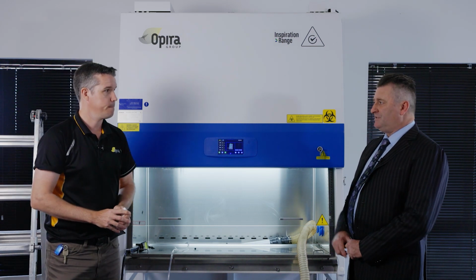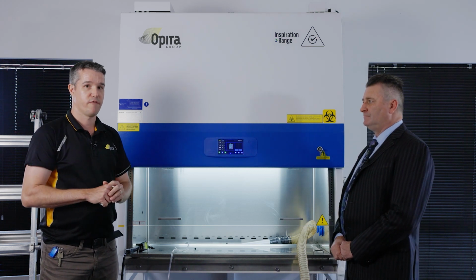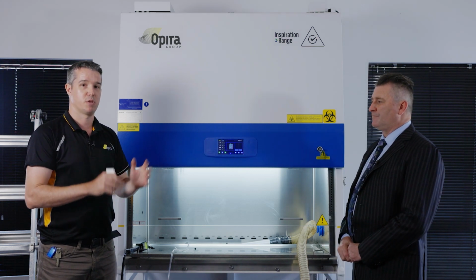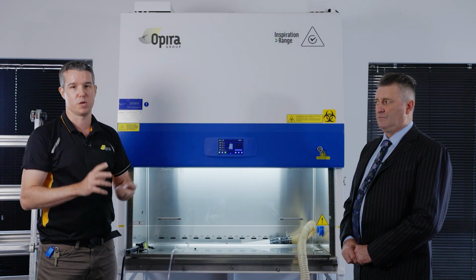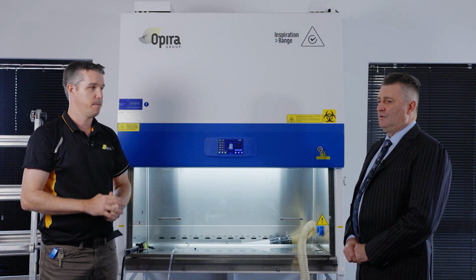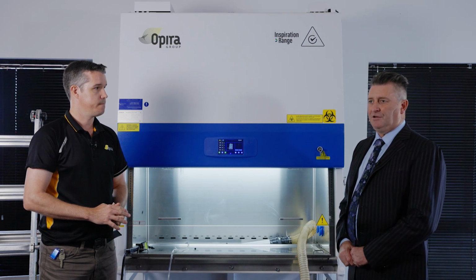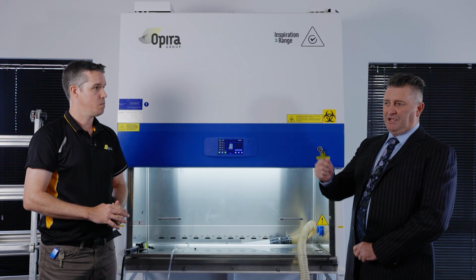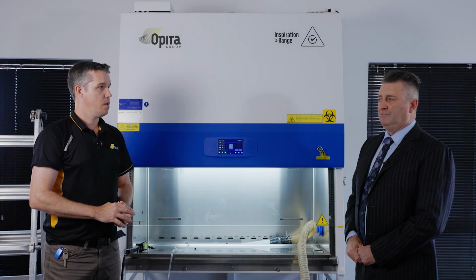And during this test, you've got the screens off both HEPA filters? Yeah, all screens must be removed from the HEPA filter. The test method requires us to measure approximately 25 mil from the filter face, so any screens have to be removed as well. And in the scanning process, Curtis, is there a speed, and are you covering the whole filter and all of the seals? What's the actual process?